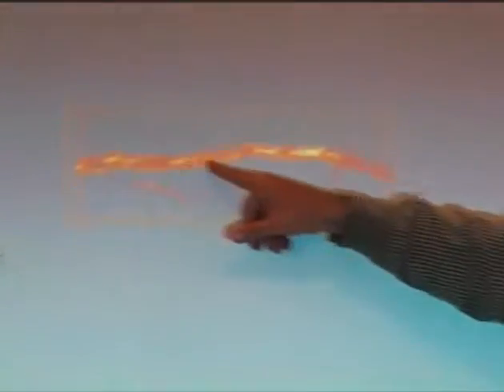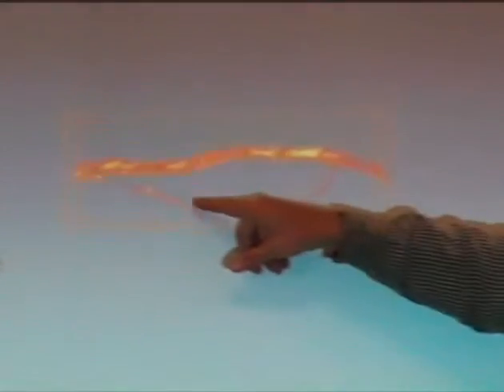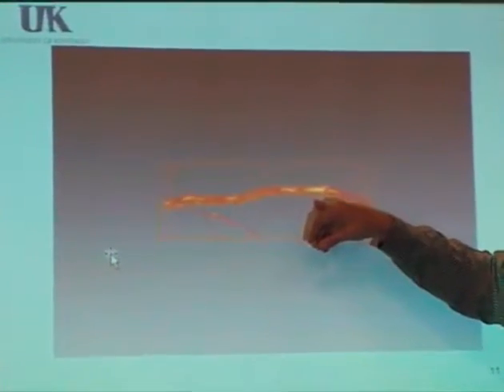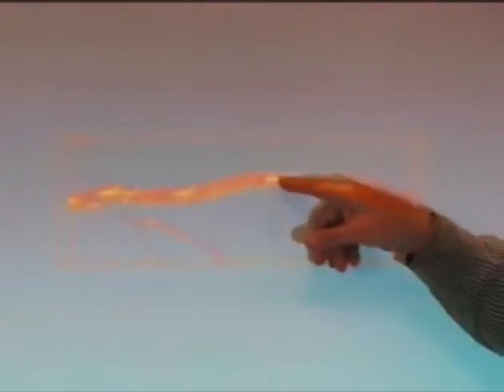If you look at this, this is the carbon nanotube here, a big multi-wall, then here's two little skinny ones, and we hope that these bright spots are some iron catalyst stuck in there. Because what we'd really like to do, getting at the catalysis issues that Ushi was raising before, is be able to image through this particle, and then using the build software, where we're building a three-dimensional object, we can assign colors to different things. For example, can you run it again? Yeah, I'll run this again so you guys can see this again.